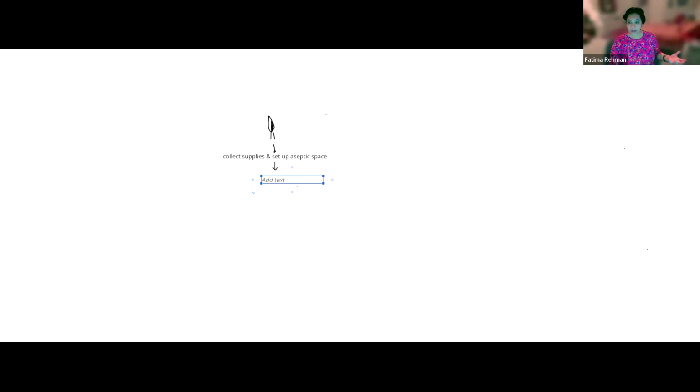Are you just going to use it straight up? What type of tubes are you going to use? Mini tubes, like 0.6 ml? Which size centrifuge tubes? Yeah, they're 15 ml ones. So in 15 ml conical tubes, right?